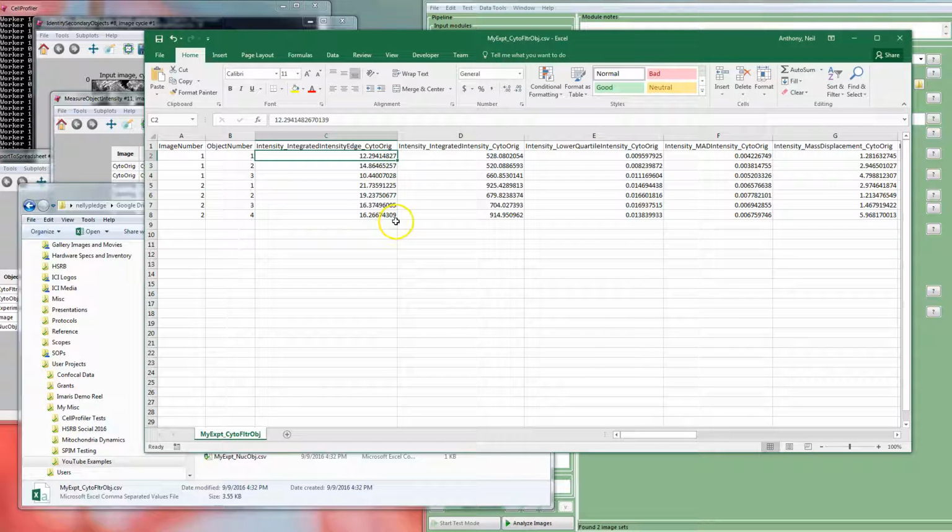And then you'll get the intensity. And again, these ones are fractional, so you need to times it by 255 or 4095, for example, to get the absolute numbers. Intensities are kind of arbitrary for most intents and purposes. It's just a number. So if you wanted to, you could just stick to fractional numbers and treat them as percentages, and that would work too.